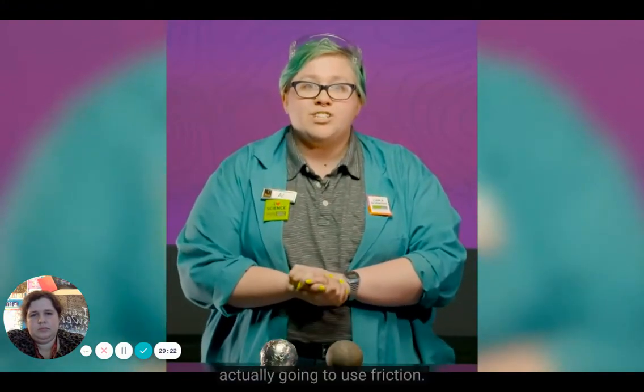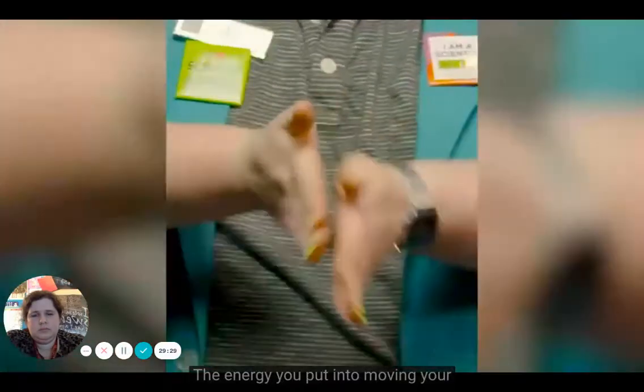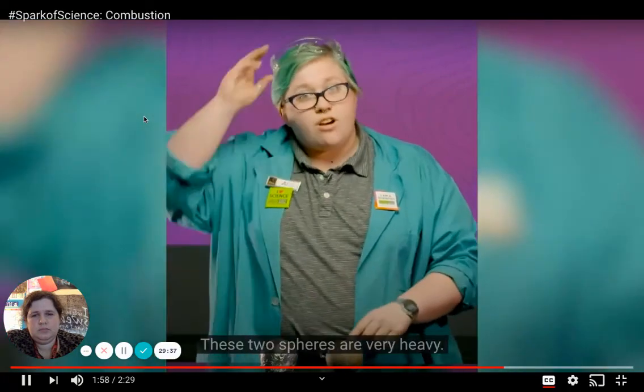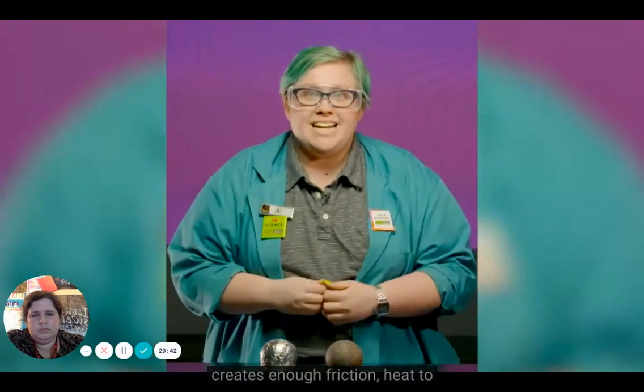For our last ingredient, heat, we're actually going to use friction. You can experience friction if you take your hands and you rub them together. The energy you put into moving your hands is being lost as heat between your palms. But for this reaction, we're going to take that friction up a notch. These two spheres are very heavy. So when I slam them together, it creates enough friction heat to start our reaction. So let's take a look.